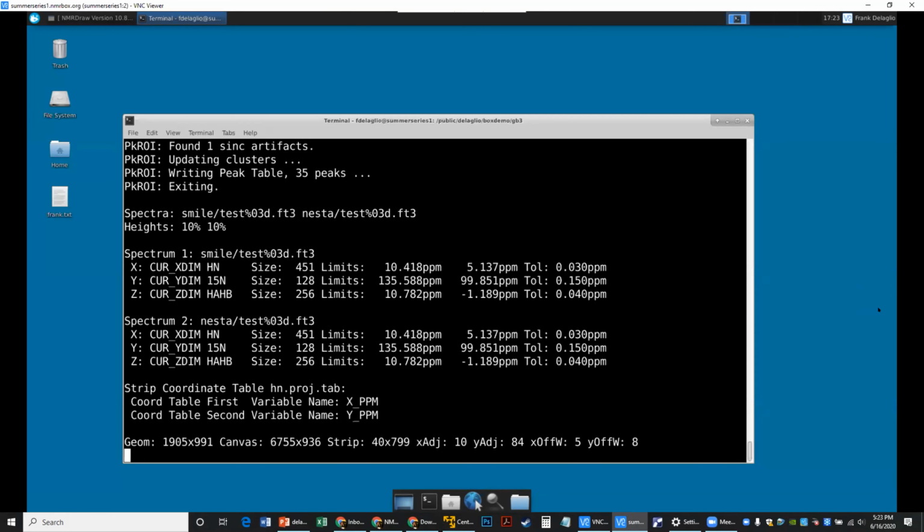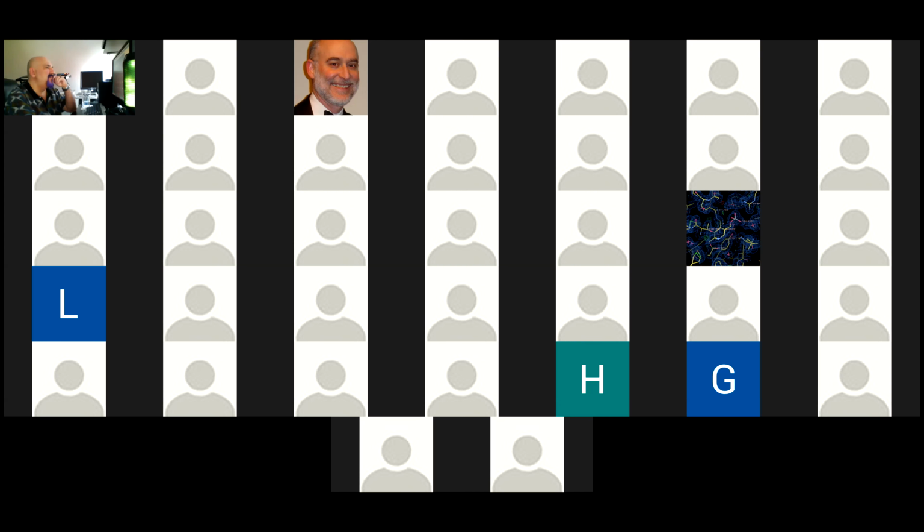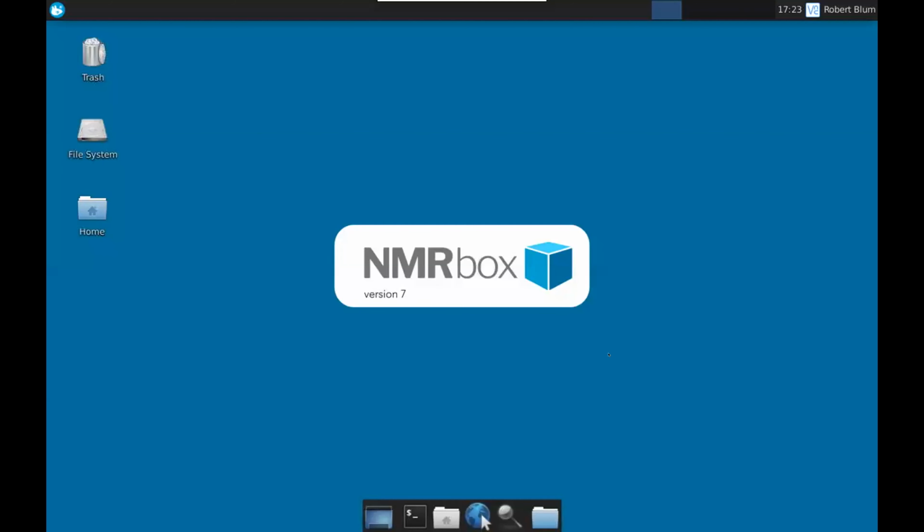Do you have the ability to share your screen? Not while you are sharing your screen. Okay, in that case, then yes. Very good. Do I have a way to request control of your mouse and keyboard? There is a button for that somewhere. Yes, I'm looking.